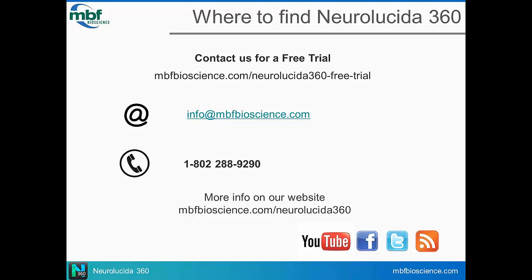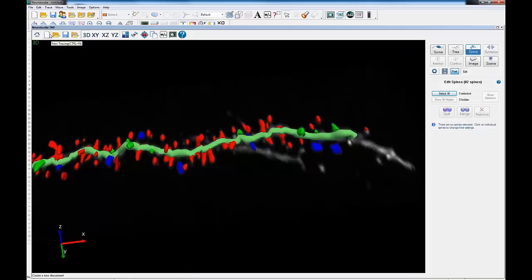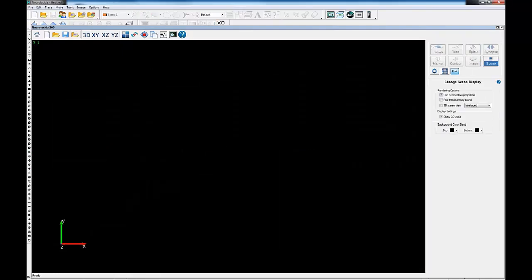4% with the glutaraldehyde. So I know for all of my other immunohistochemistry techniques, I do a flush with PBS followed with paraformaldehyde. But in these situations, I do the 1% for the injections. I do the 1% followed by 4% glutaraldehyde.